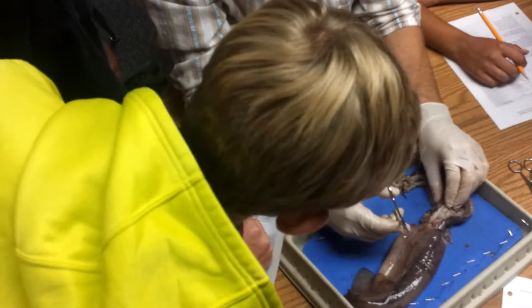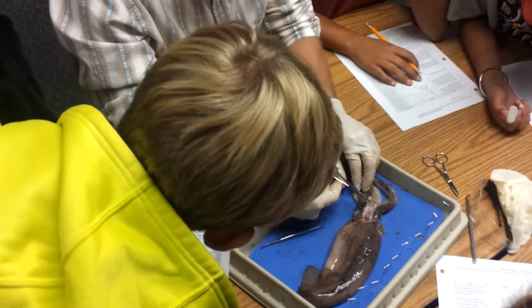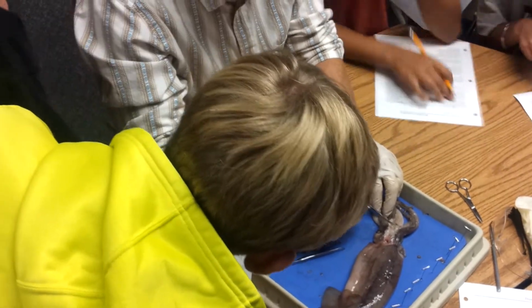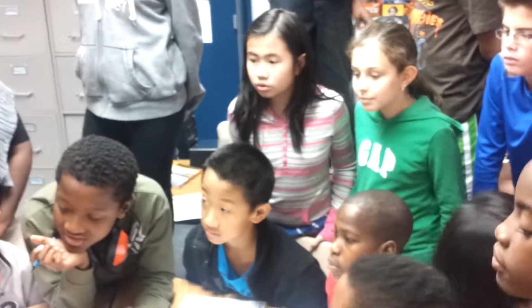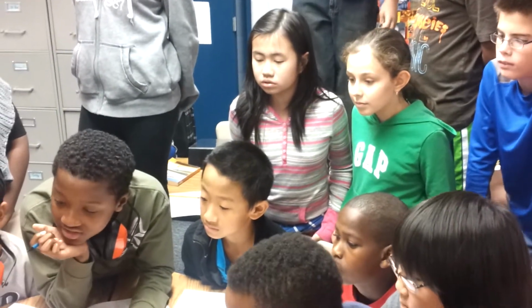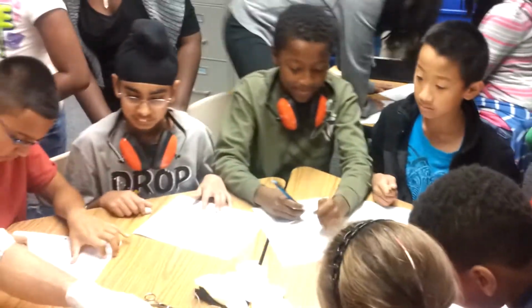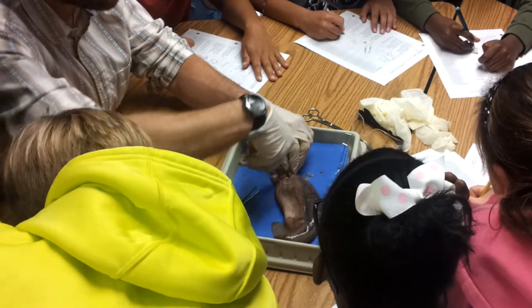So, if you look in the center here, this little ball here are the muscles that held the beak. So you're looking at the outside of the mouth. The mouth is on the inside with the beak, and this is the muscle that helps the beak open and close. Please draw yourself a picture showing what the inside of the head looks like.